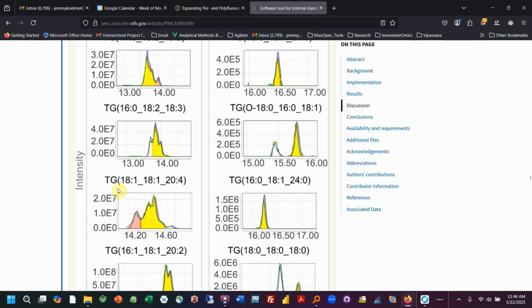And so from sample to sample, it's actually getting very different peak areas, not based on concentration in that sample, but based on how it's cutting off where it starts and where it finishes. Whereas peak height, as long as the isomer that's tallest is tallest more often, it will always pick that same peak height, not taller more often, taller all the time. If it has two isomers and one becomes taller than the other in a sample, then that will also cause an issue.